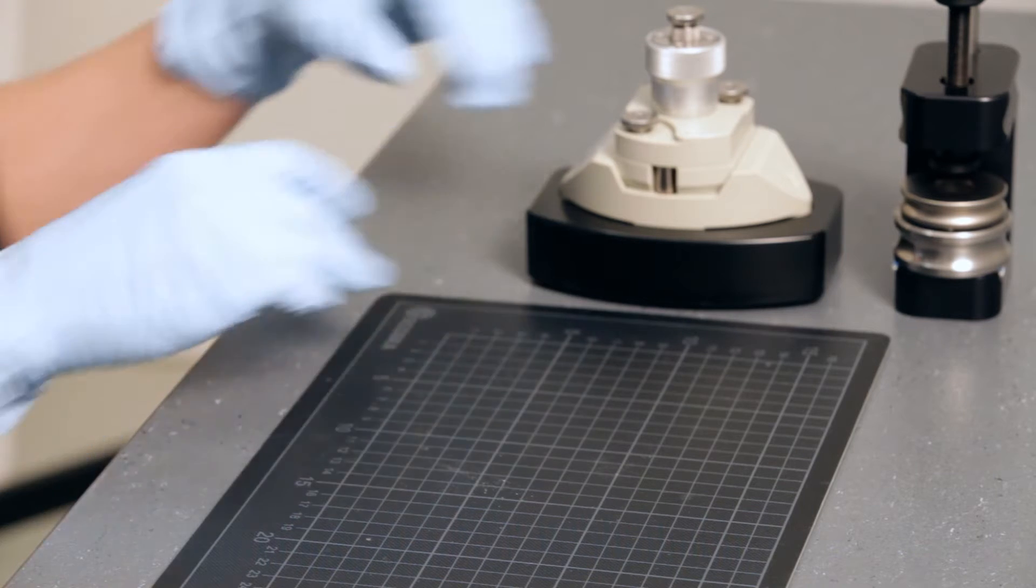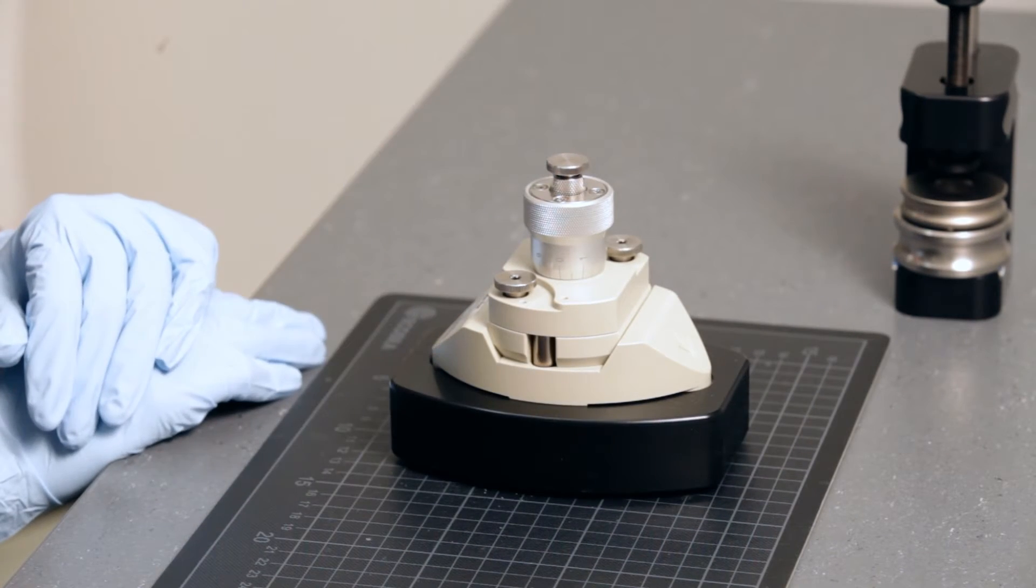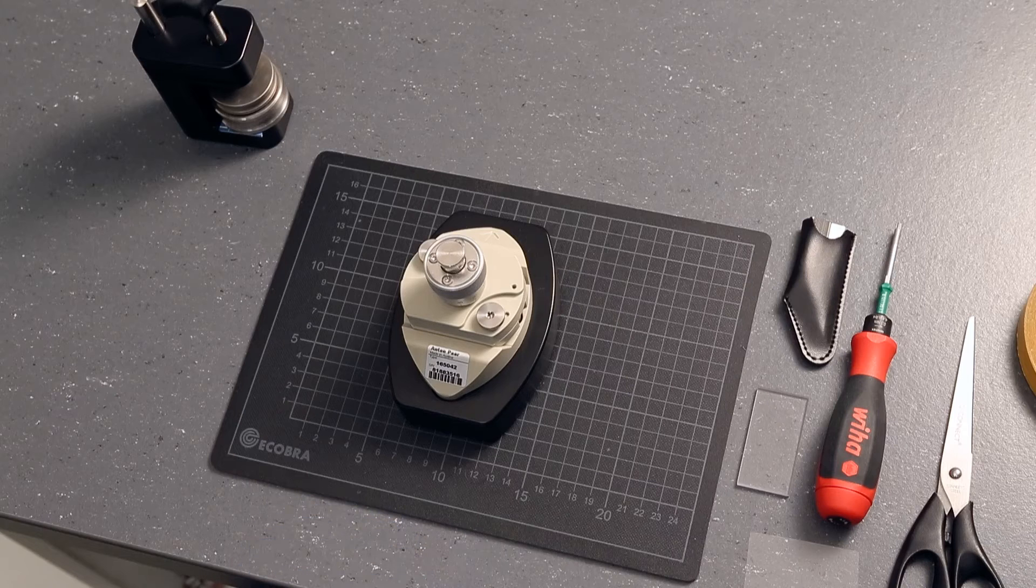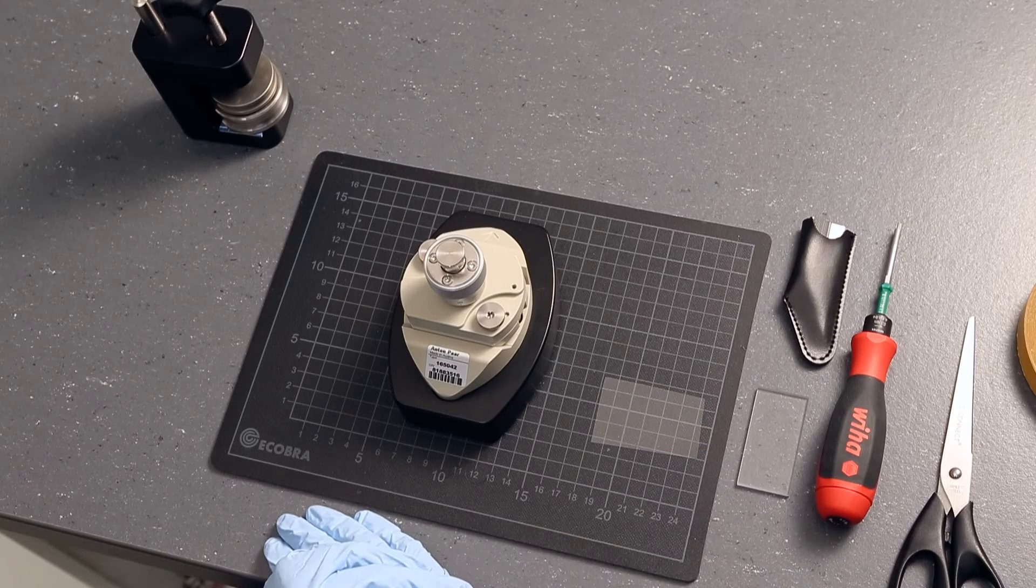This video shows you how to mount your sample in the adjustable gap cell for discs and how to mount the cell in Surpass III. We are going to mount a polymer foil.